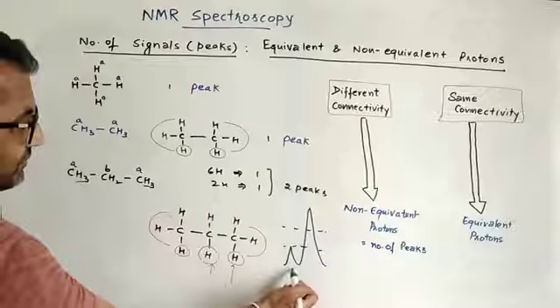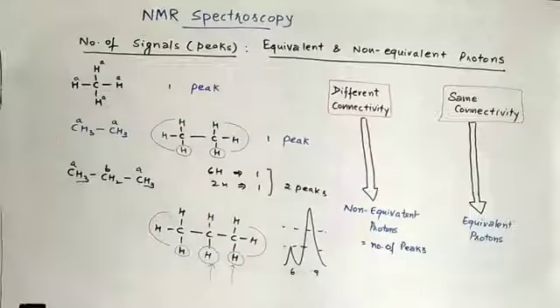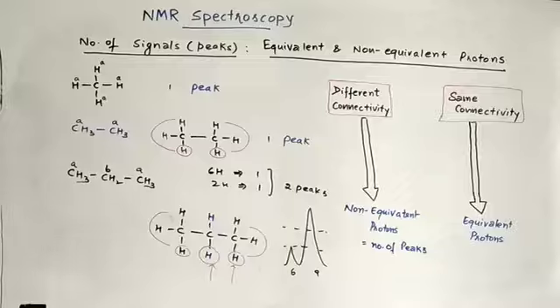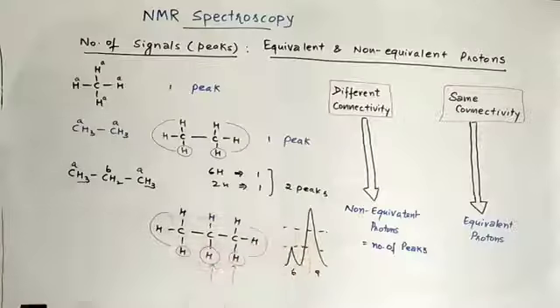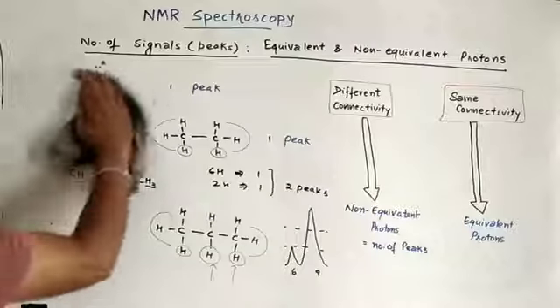This is because of B, this is because of A. This is an integral part of the NMR spectrum: from the height we can get the information that peak A is because of a larger number of protons as compared to B, and by measuring the ratio you can find out that they are in the ratio of 1:3. Okay, next example.